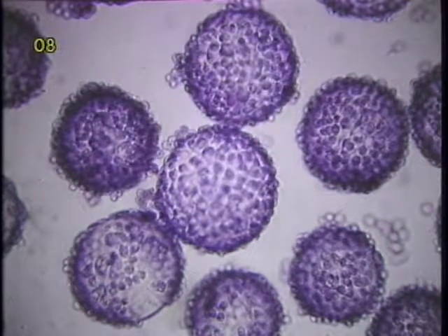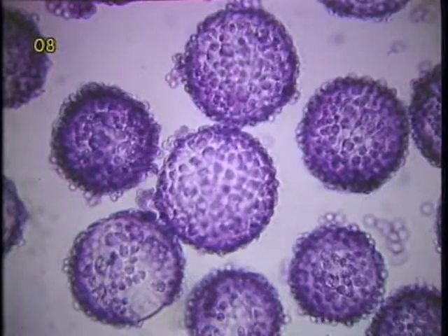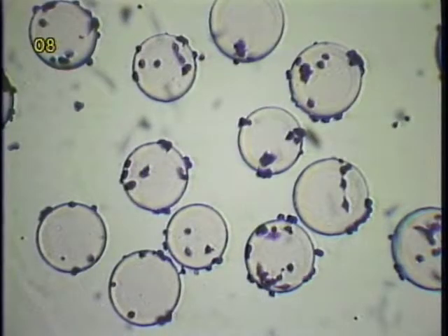This procedure of releasing nuclei from microcarriers is generally applicable to different cell types. For cells which are only poorly attached to microcarriers, they fall off easily and the count may not be accurate.